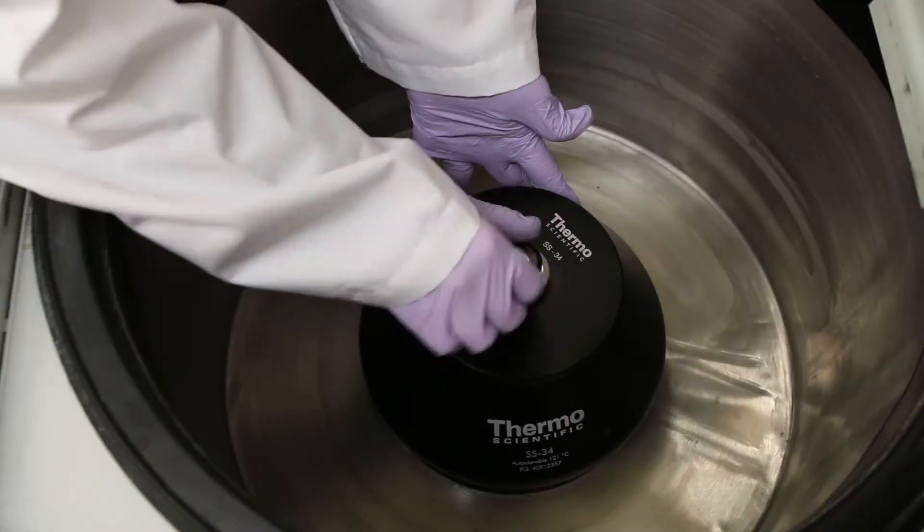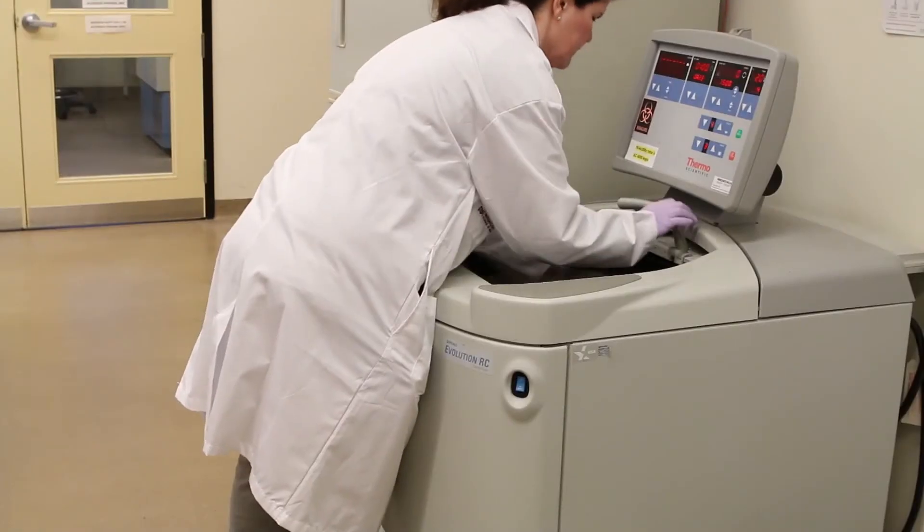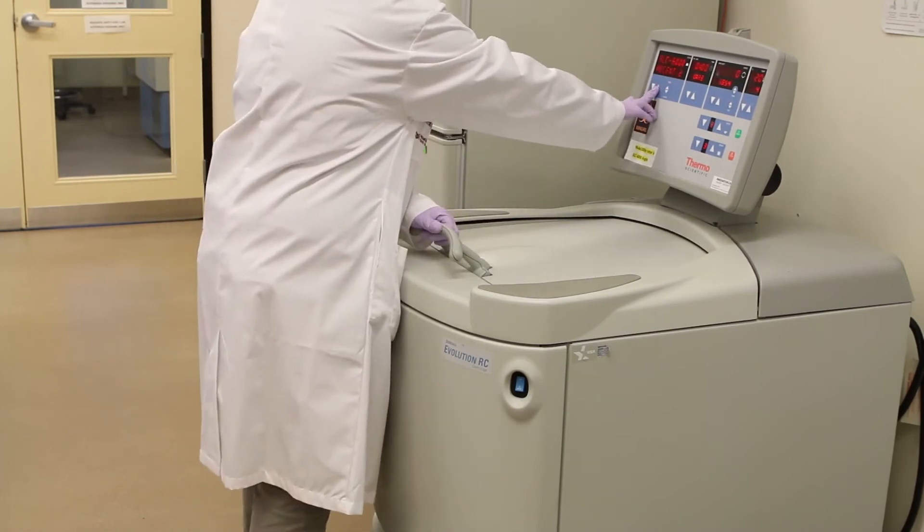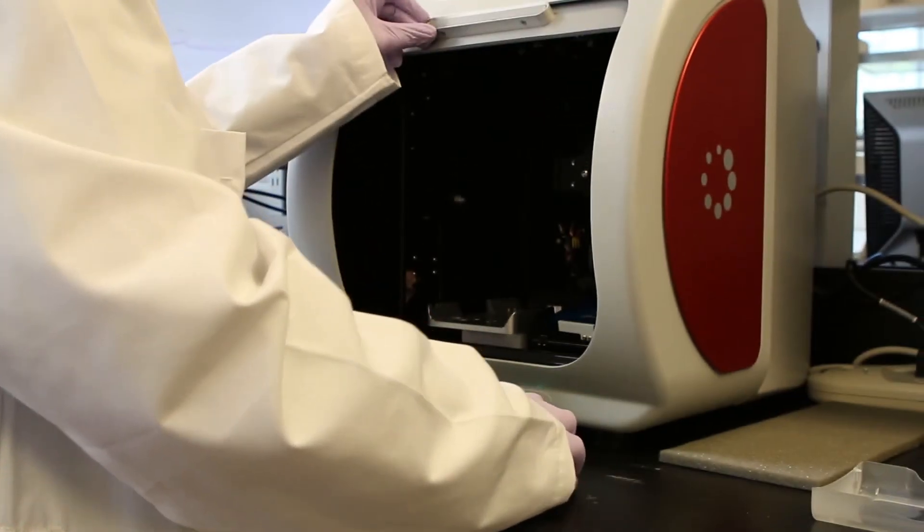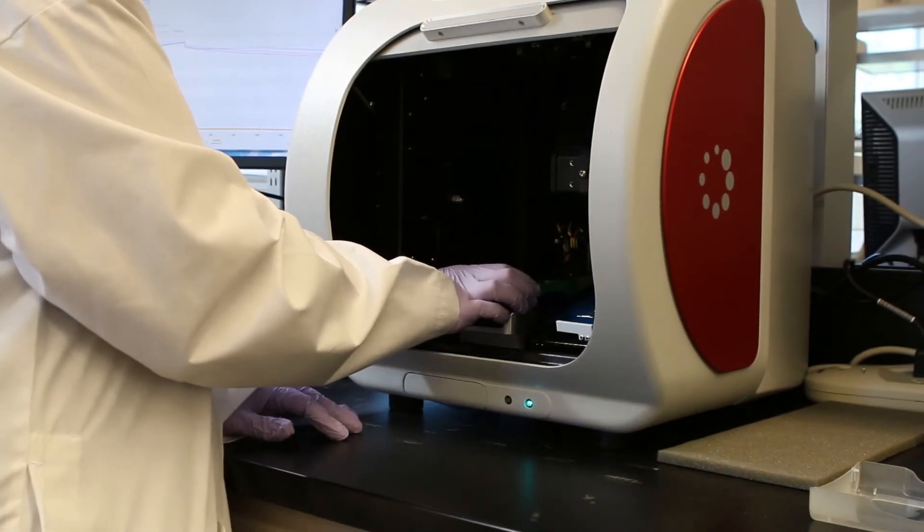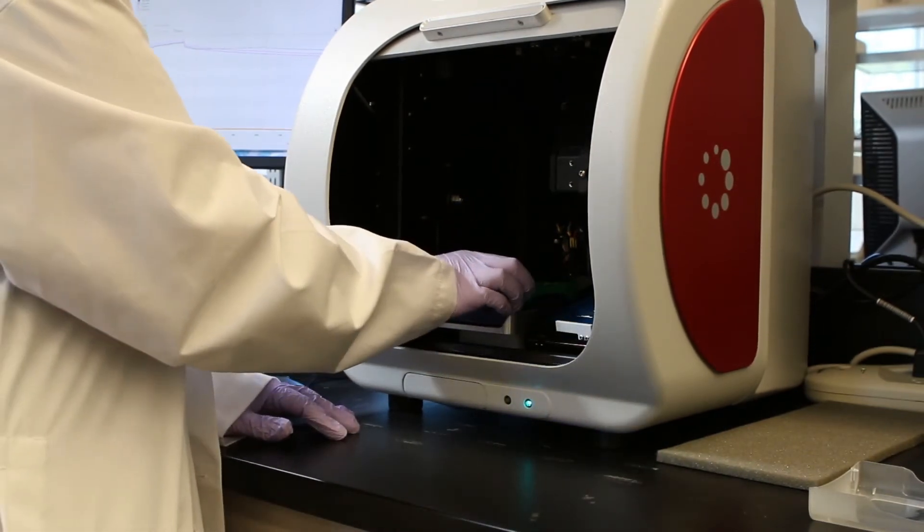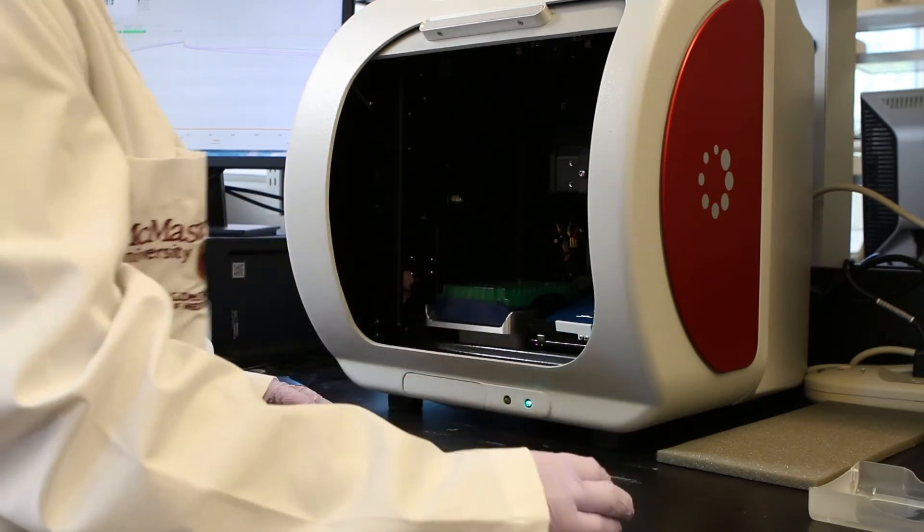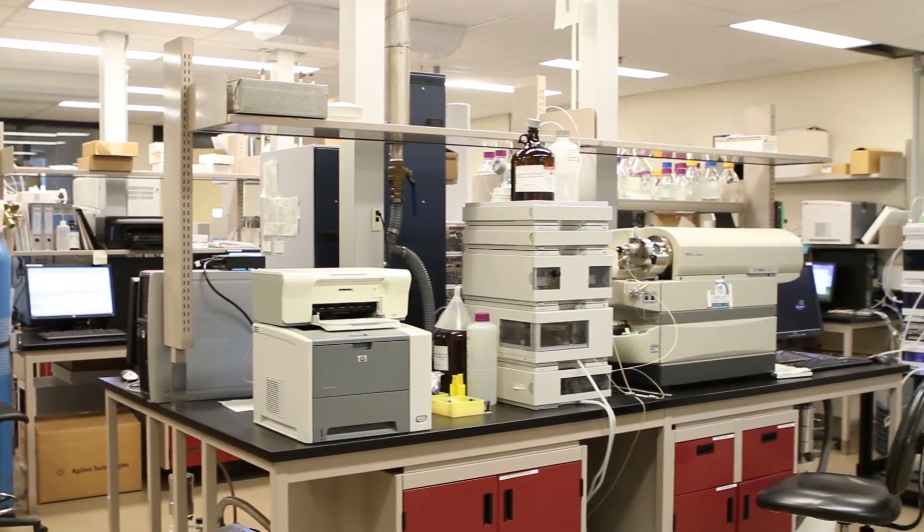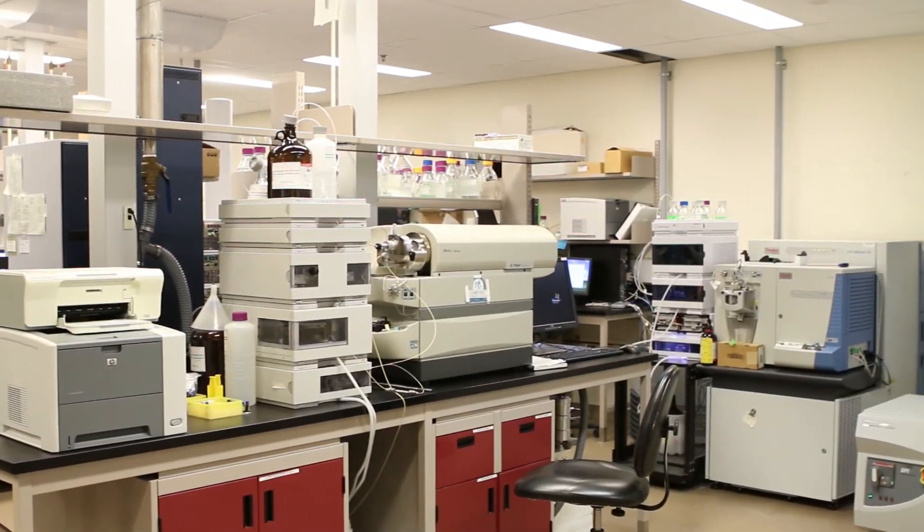In the protein lab, we have equipment for protein purification. You can overexpress proteins, purify antibodies. We can do ELISA type assays. We get a lot of clinical type samples where people will want to do an ELISA for it, and then we help them. We have biological safety cabinets if they just need to use safe, sterile environments. There's a lot of different things that you can do in the protein lab.